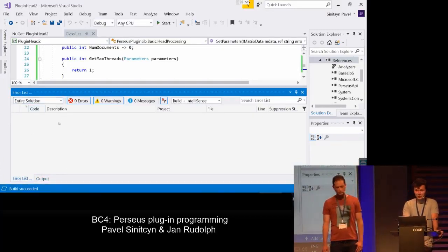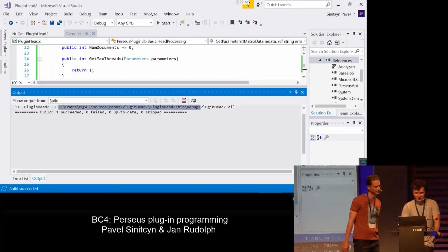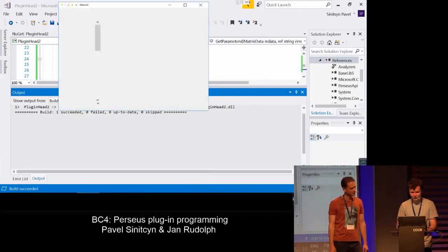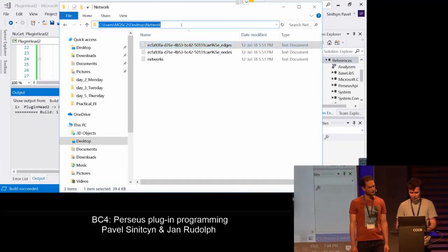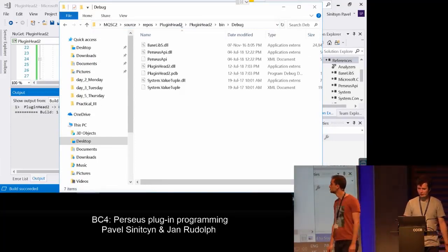Something is written in the error list. In this case, you will not be able to compile. But here, you see, something has appeared: Succeeded. Yeah, it's actually not something that happens frequently, especially in tutorials. So what should we do now? We can open it and see what is there.